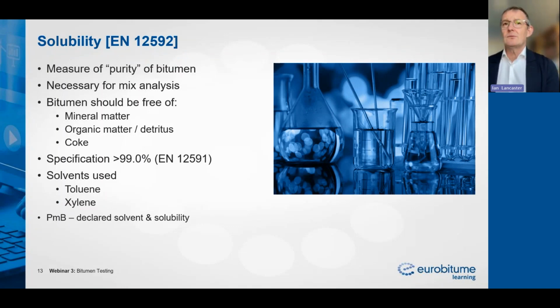When we assess the solubility of a polymer modified binder, we have to rely upon the manufacturers to define the best solvent to use to assess the solubility of their products, because it's too difficult for us to do that within a specification.